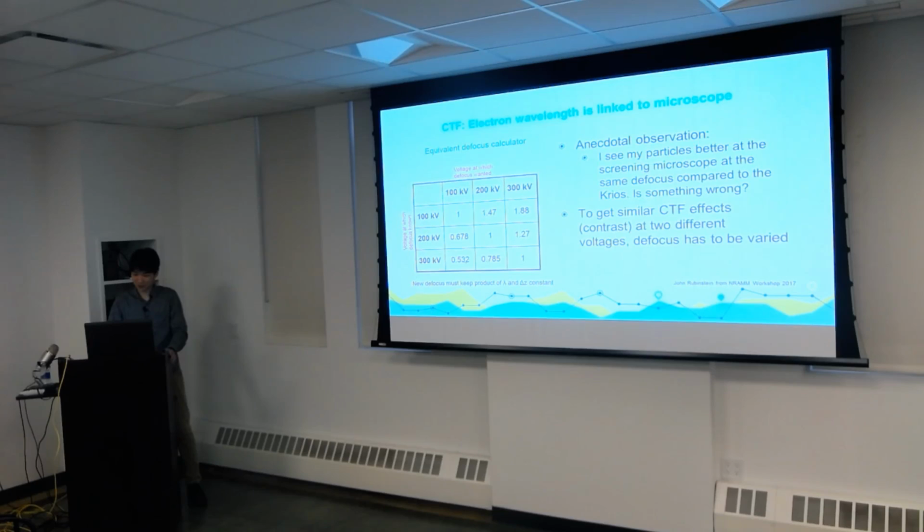So it's just something to bear in mind that if you don't see your particles very well already on a screening microscope, then maybe there's no point to get a Cryo-EM. But also don't worry if you don't see your particles with the same contrast as you do on the Cryo-EM itself. Okay, so CTF varies with the microscope voltage.